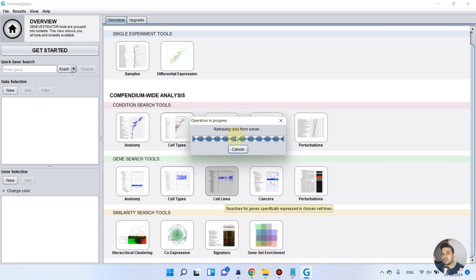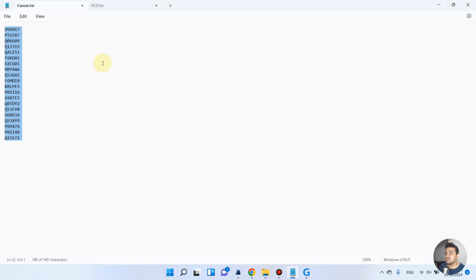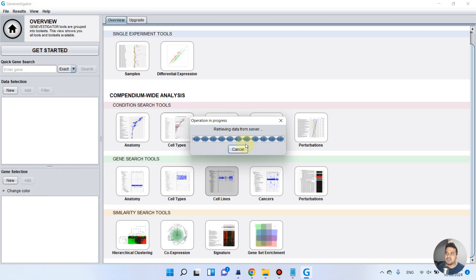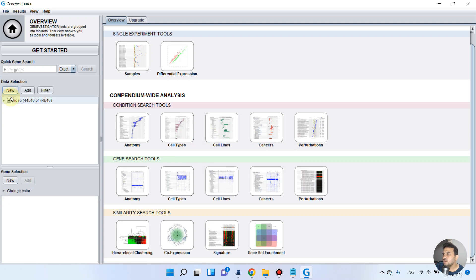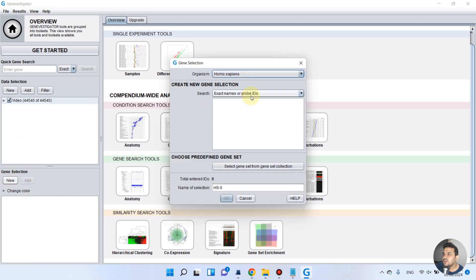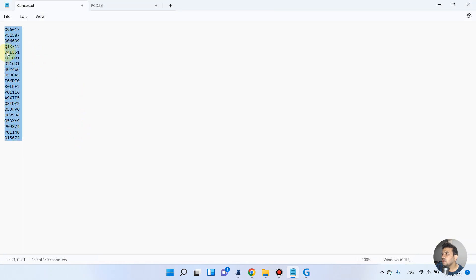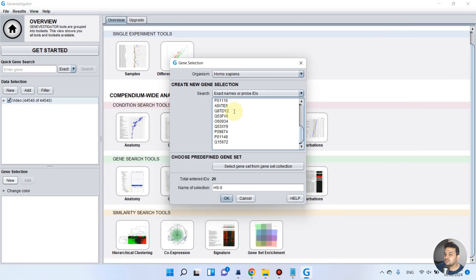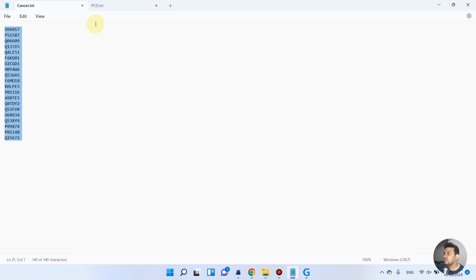As you can see, it is now automatically retrieving data from the servers on the back end. Now we will upload our list of genes under this selection. Let's wait until the data retrieval from the server is complete. Once our data is selected on the back end, we go to gene selection — select the organism, create a new gene selection, and simply copy the cancer genes. We can use a double line to make a separation between the two lists — we have 21 IDs from the cancer dataset.